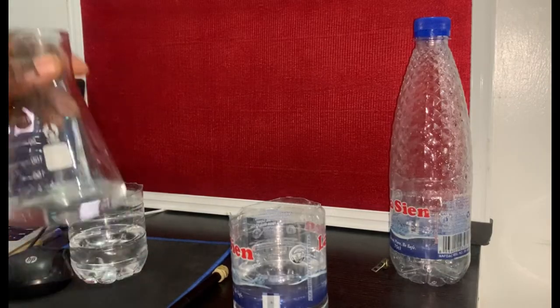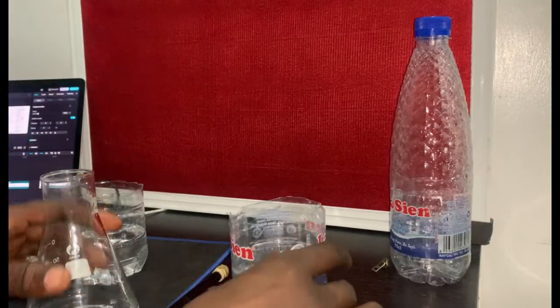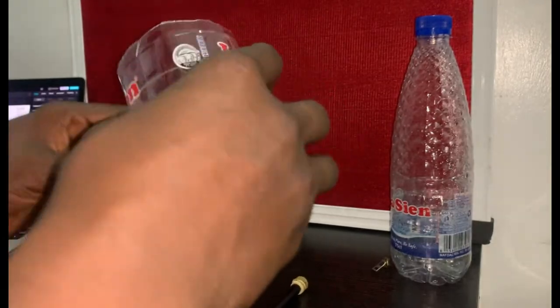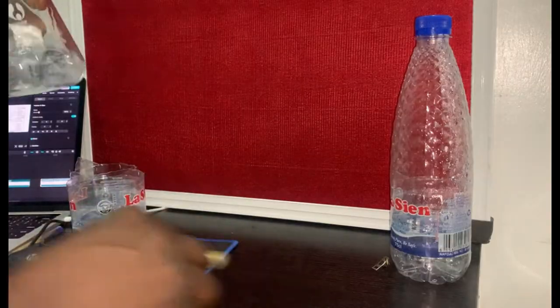So I've poured out 15 ml of water. This is water inside a flask. Now I take my B, which is alcohol. I take 5 ml and pour it in here. Then I will shake it.